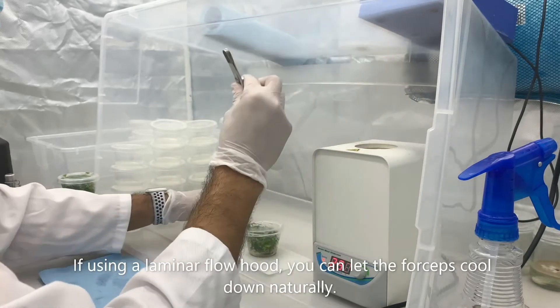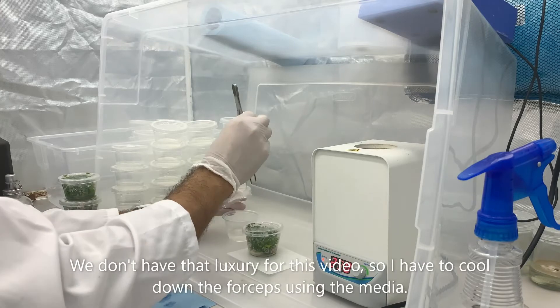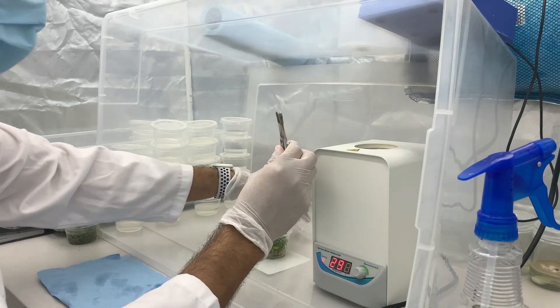If you have access to a laminar airflow hood, you can let the forceps cool down naturally. However, for this video we don't have access, so we're going to just use the media to cool it down a little faster.